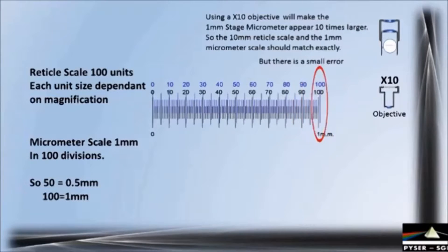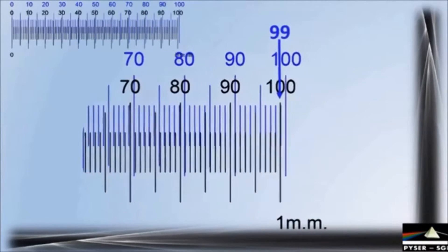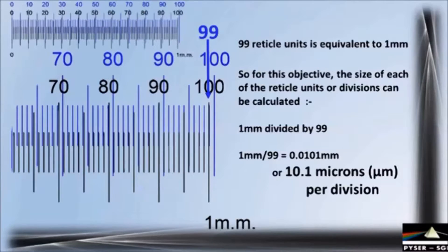Looking closely at this error, the stage micrometer 1 millimeter scale actually matches 99 reticule units or divisions. This means 99 reticule units is equivalent to 1 millimeter in length. So for this objective the size measured by each reticule division can be calculated as 1 millimeter divided by 99. Each reticule division at this magnification is therefore equivalent to 10.1 microns — that is 10.1 microns per division.